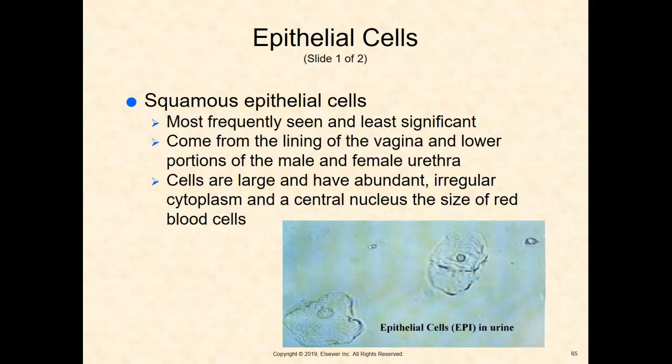So they're very large. They have a ton of cytoplasm with this little tiny nucleus in the middle. They're very distinctive. We will be seeing these in our urine when you guys come back to class.